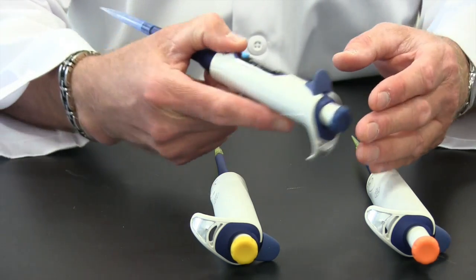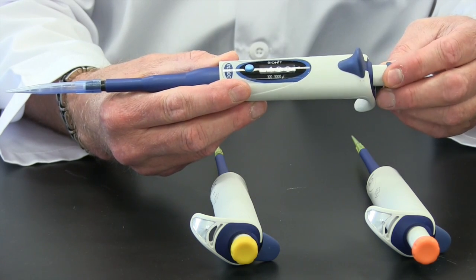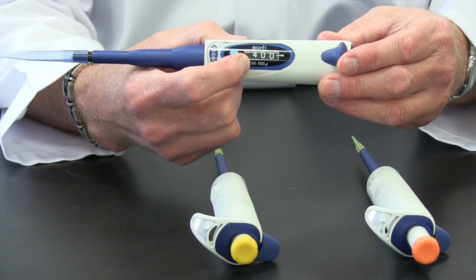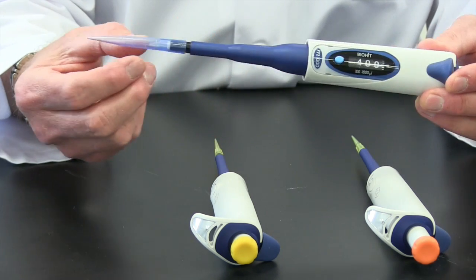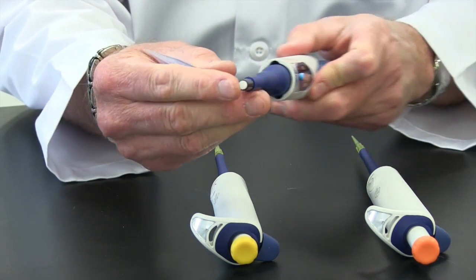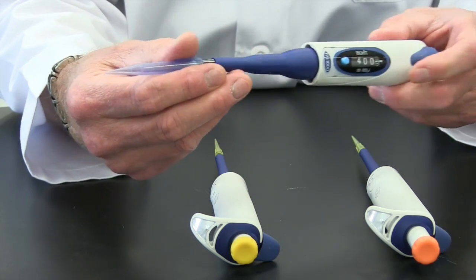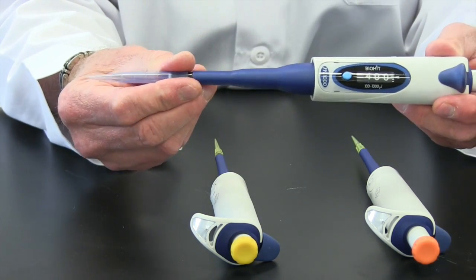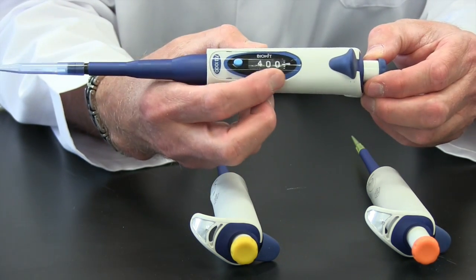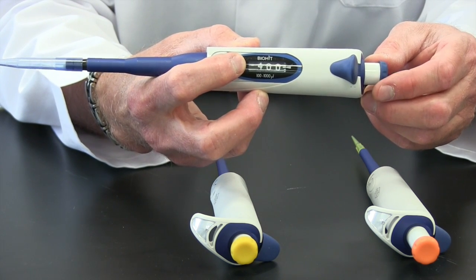So the main parts of any Biohit micropipetter are the operating button on the top, the tip ejector, the display for the volume that you've set, the lock button, the tip cone where your tip goes on, and within the tip cone is an aerosol barrier filter, which prevents aerosols or other liquids getting into the body of the pipetter.